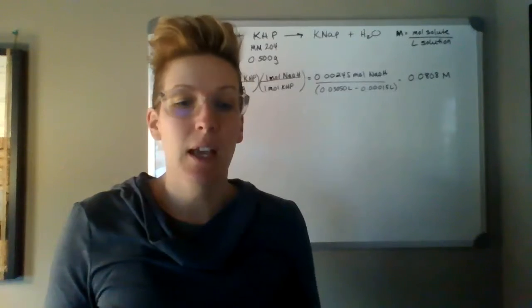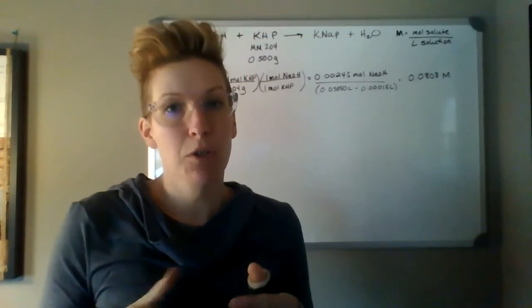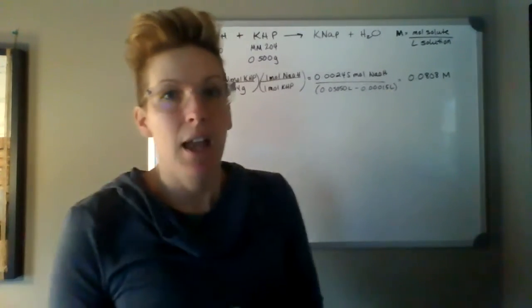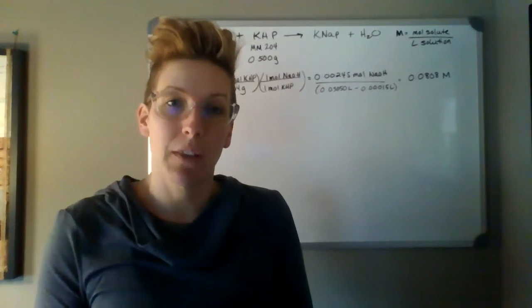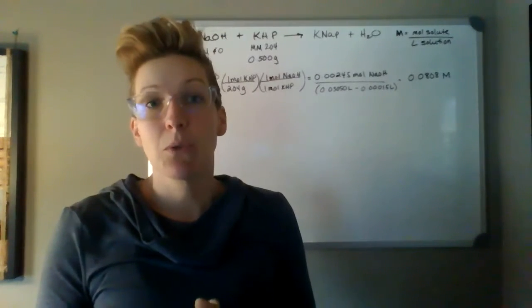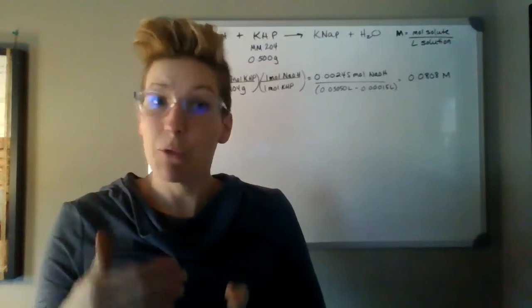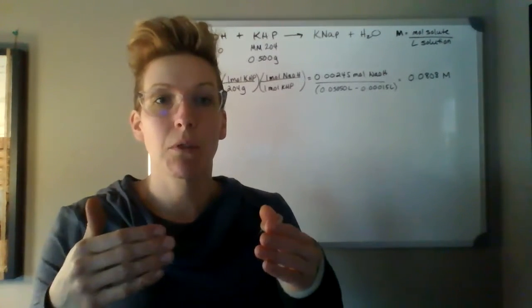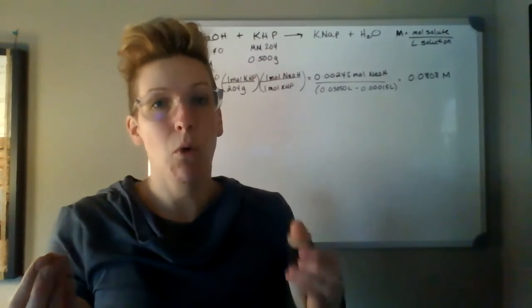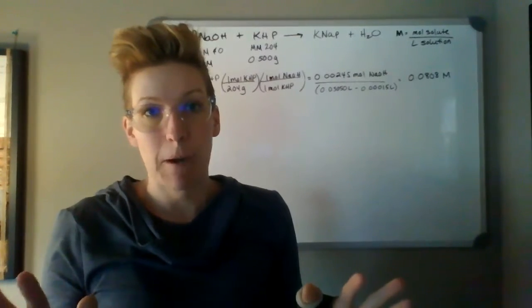So you would have, say, your acid in your Erlenmeyer flask, and that would be of unknown concentration, but you would put a known amount in. So a known volume of that acid would be in the Erlenmeyer flask, and you put an indicator in there as well. And what an indicator does is it shows an endpoint. So usually we use a universal indicator or phenolphthalein, and we know that if we're doing an acid-base titration, for example, our endpoint should be 7, it should be neutral. When all of the molecules of acid equal all the molecules of base, they will have reacted and created a neutral pH 7 solution, right?